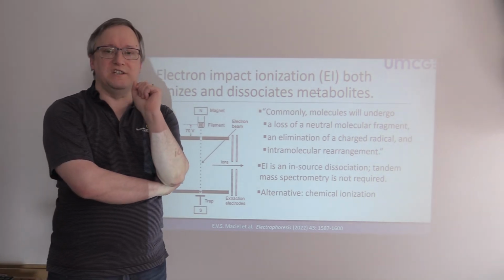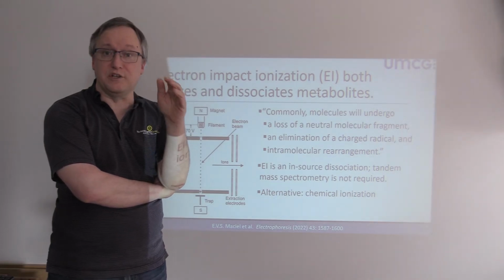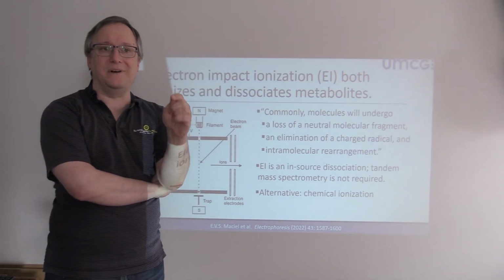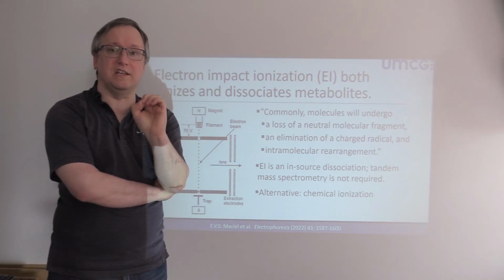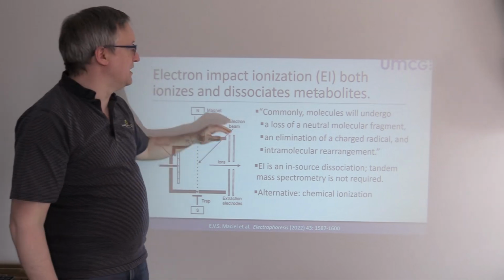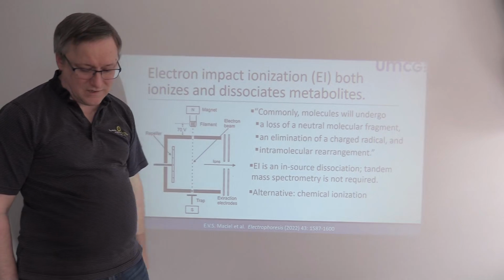When we do GCMS, these molecules in derivatized form are coming off this very, very high temperature column, but unless they're ionized, we're not going to see them in mass spectrometry. So we must ionize these things, and the most common process we use for that.